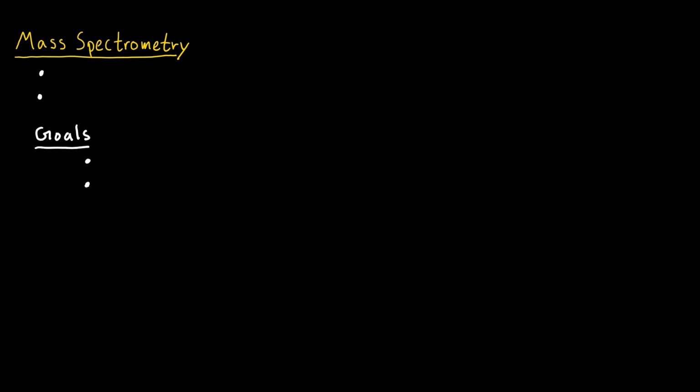In this video, we're going to introduce mass spectrometry. So, what is a mass spectrometer? It is an instrument that we use for molecular analysis, when we want to know information about entire molecules. And the main data that we get from it is data on the molecule's mass.